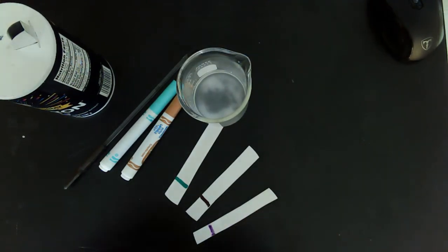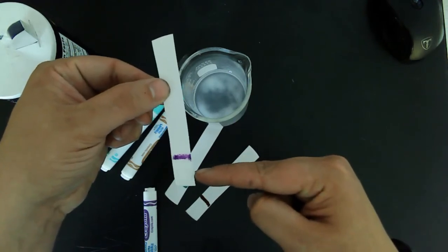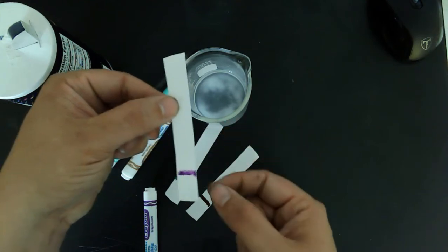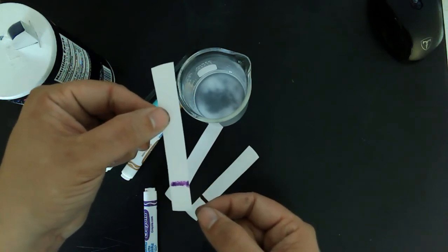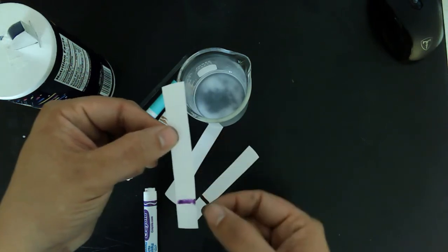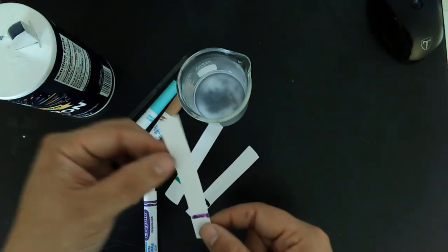Okay, now I'm going to put these strips in the solution, but the solution will not go above this marker level. The solution is going to sit at about this halfway point. The saltwater solution is going to travel up the paper. As it travels, that physical property we talked about, solubility, things dissolving, is going to dissolve or pick up that pigment and carry it up the paper. The smaller pigments will go up faster, the larger pigments will go up slower, and as the salt water travels up the paper, it will separate this mixture, if this purple marker is indeed a mixture of two different pigments.